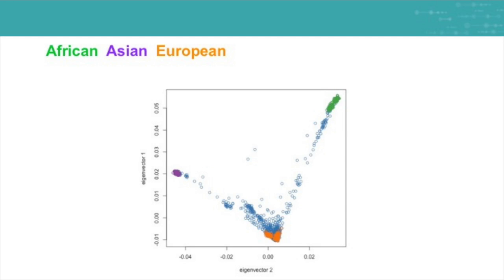You can see that they map very well, they're very well separated. And cool, so I have 2,400 open access 23andMe genotypes that I can do whatever I want with. Obviously, that doesn't mean I'm going to look for identity, but that I can now do specific research questions on this reference data set.